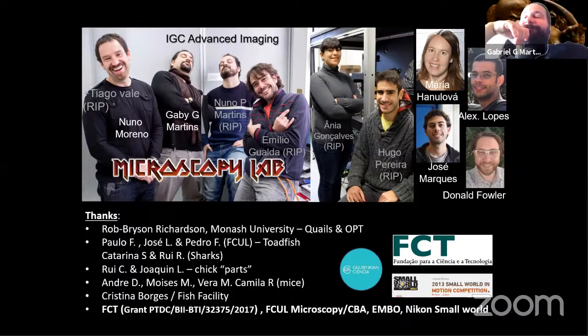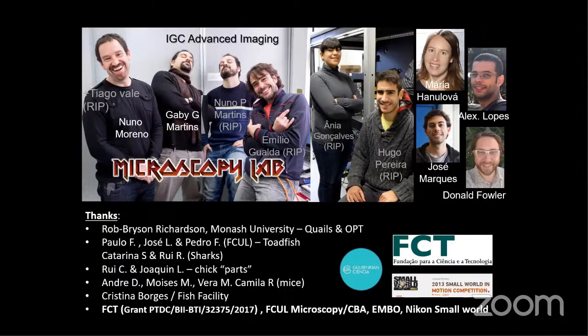I just wanted to push back a bit on you, Gabi. My question was really about, in these ultra high resolution techniques where you're really pushing the capabilities of your imaging, but at the same time you're doing tissue clearing where you're ultimately stripping everything but the proteins out of your sample, how far is it worth going in your imaging? When is your sample limiting the value of going higher? Good question.